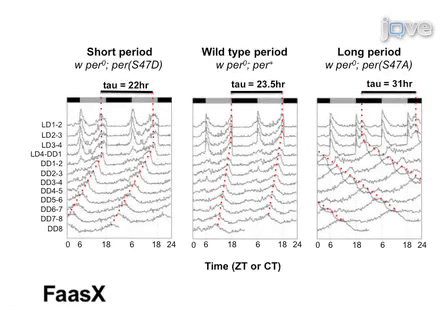In addition to eduction graphs, locomotor activity data can be represented as a double plot actogram for each individual fly or fly genotype, where 2 days of data are plotted sequentially on each line, but the last day's profile begins the next line of 2 days' worth of activity. For example, LD1 and 2 are plotted on the first line of the actogram. The next line begins with a repeat of LD2 and is followed by LD3 and so on. Following this format, the locomotor activity data spanning the entire experiment is illustrated in the actogram.